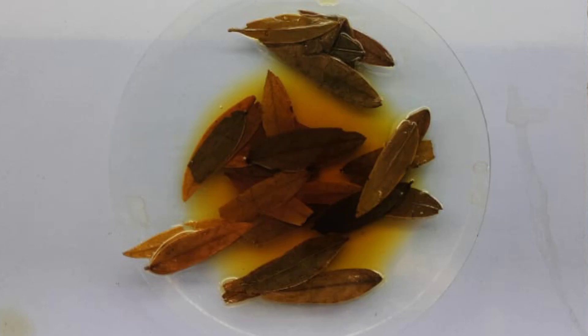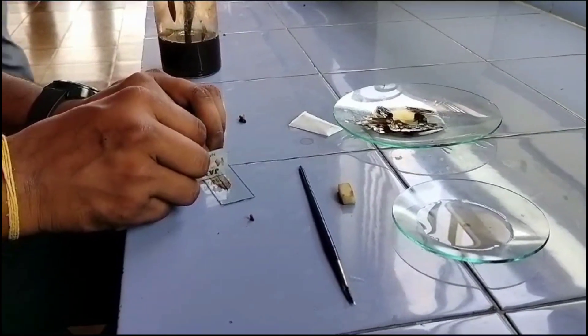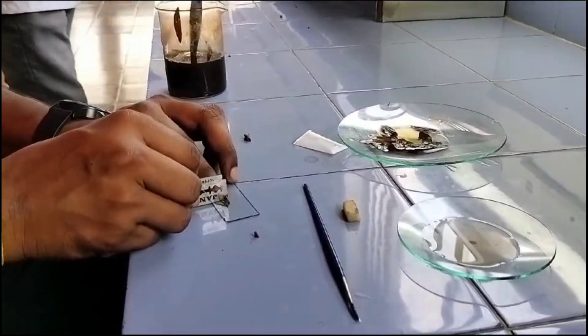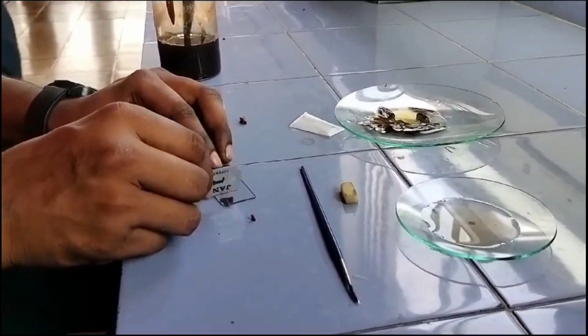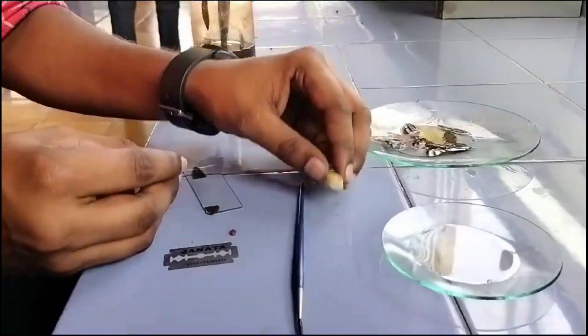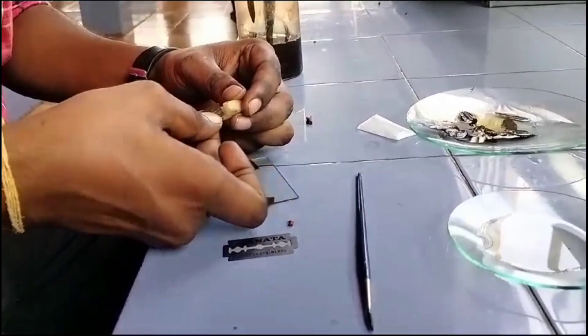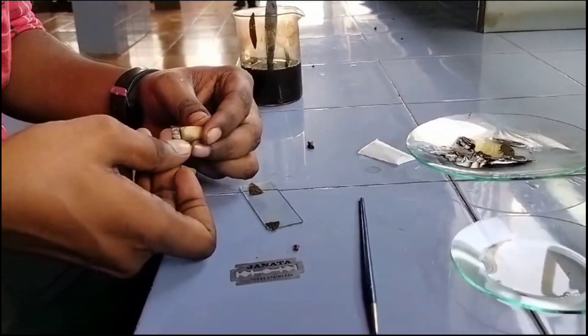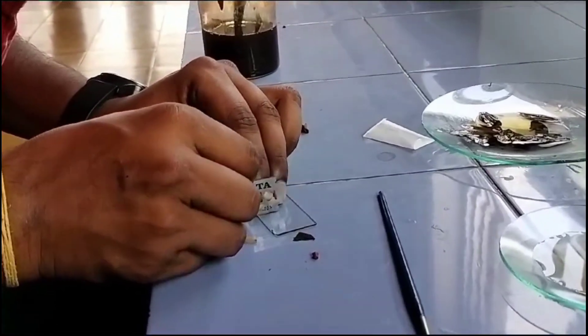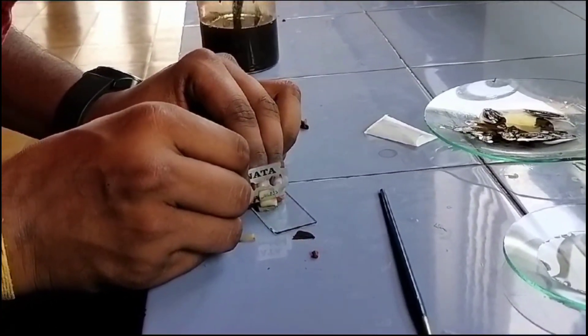Now let's study the transfer section of Senna leaflet. To study the transfer section, the leaf should be immersed in water. The section is taken using the Sandwich method, in which a potato is used. Initially go for a hard cut, followed by a thin section as thin as possible.